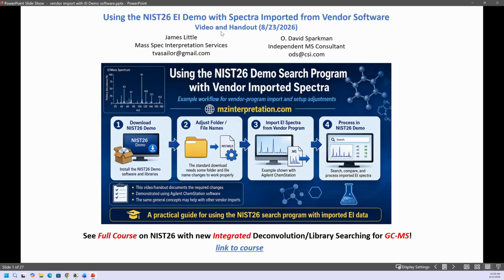This video and associated handout concerns using the NIST26 EI Demo with Spectra imported from vendor software. It is a part of a larger course on integrated deconvolution library searching with the new NIST26 software for GC/MS analyses. And here's the link to the course on my website.